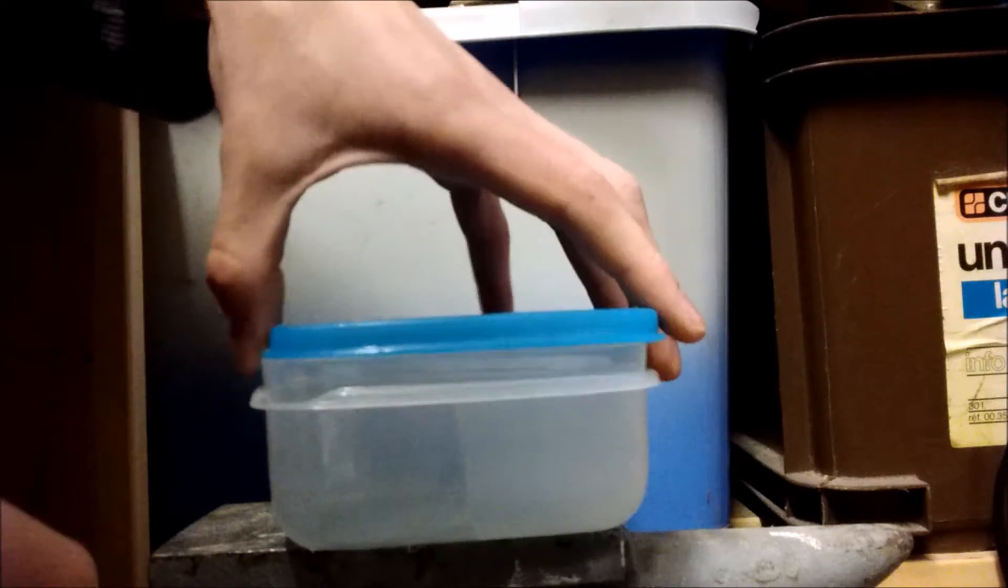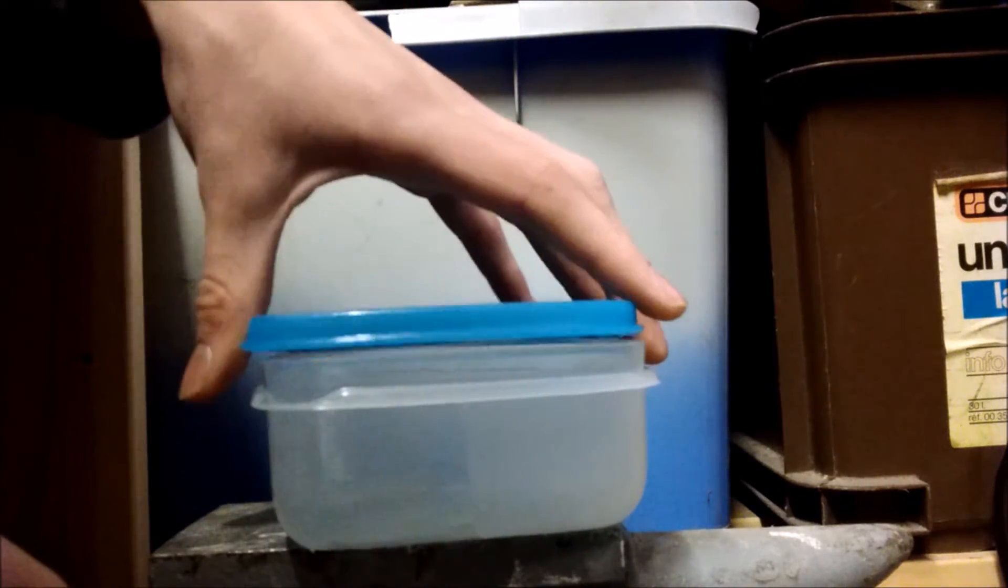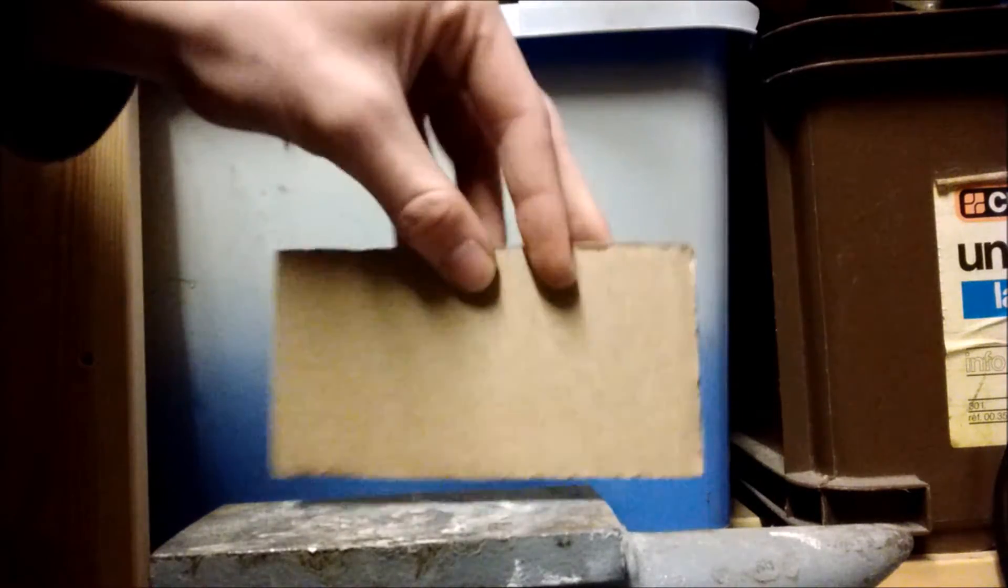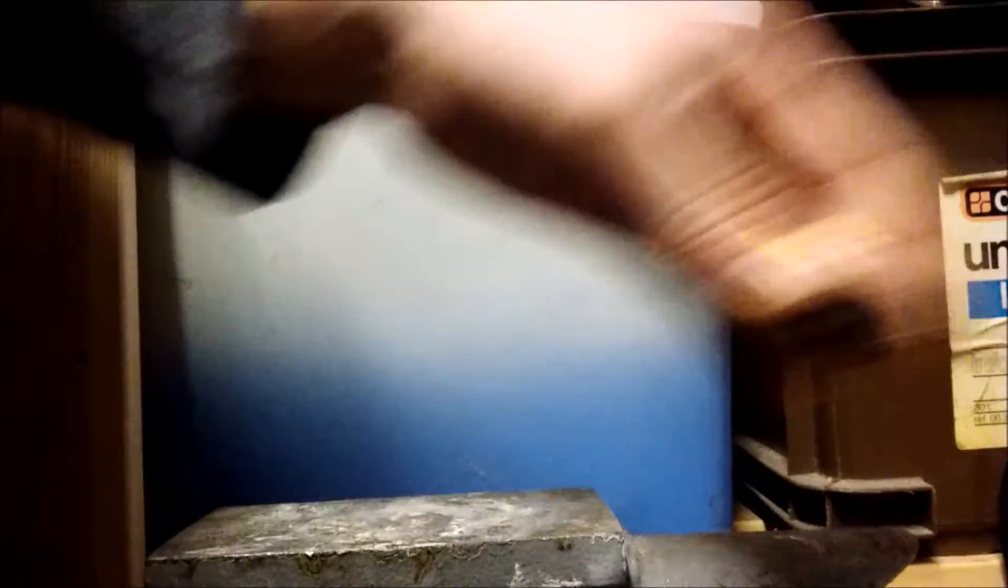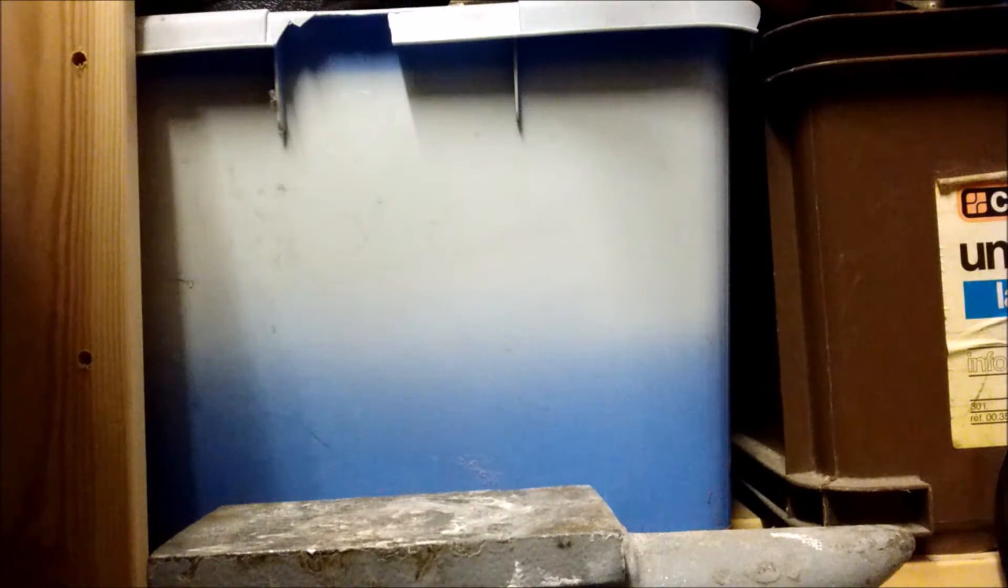So, what you really need to make a simple one of these is just a Tupperware container, a piece of cardboard, fairly simple, some glue, again fairly simple, and you need something to act as the desiccant.